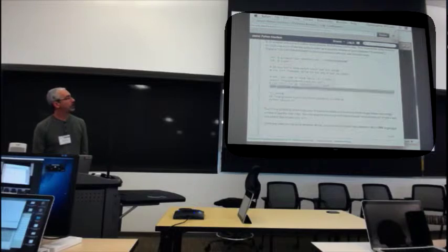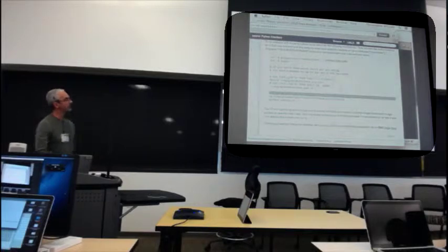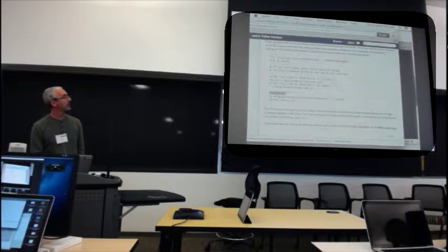Okay, since I didn't see too many more hands raised, I'm going to keep going. Then we do this rather unfortunately named sit setup command, which I don't like. This is setting up the analysis-specific environment, getting all of Psana set up.